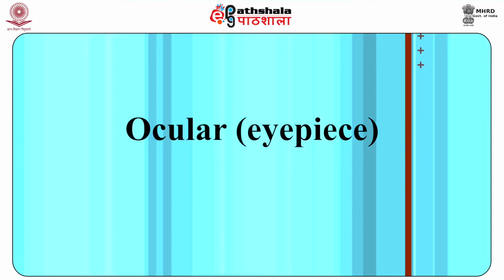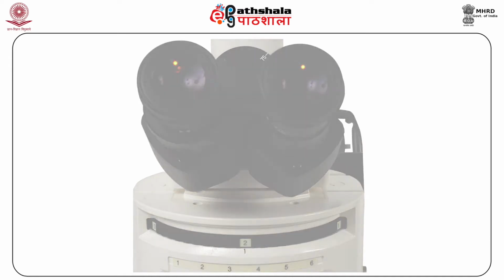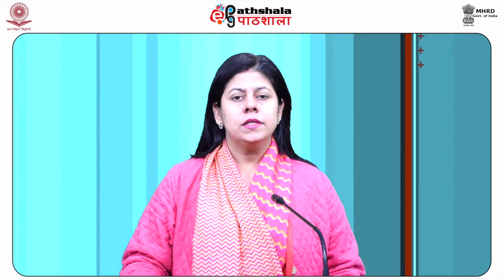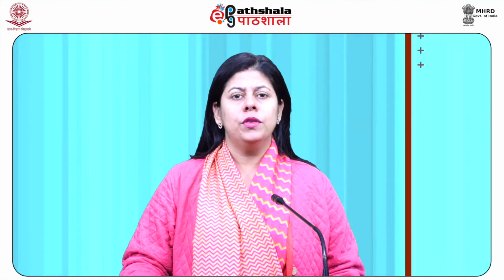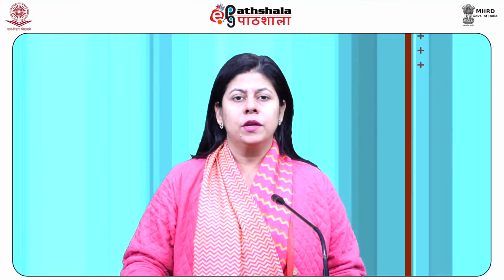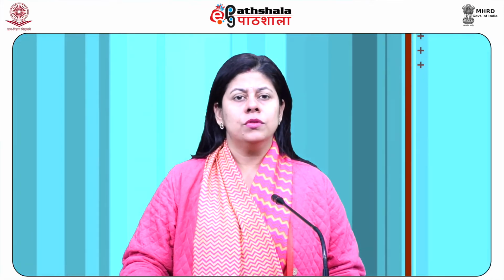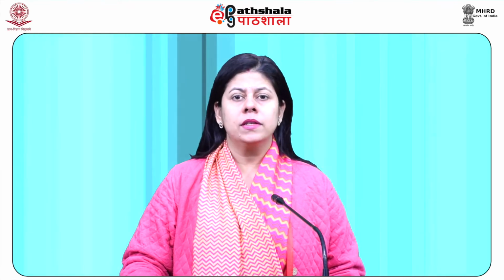Ocular eyepiece. The ocular or eyepiece is a cylinder comprehending multiple lenses. Its purpose is to converge the image in focus. The top of the body tube has an eyepiece inserted into it. These eyepieces can be switched with numerous other eyepieces which can be inserted with variable degrees of magnification. Magnification values for eyepieces comprise 2 times, 5 times and 10 times.